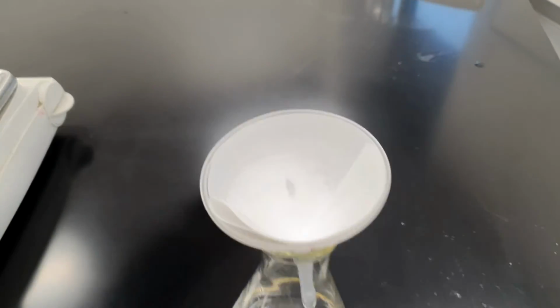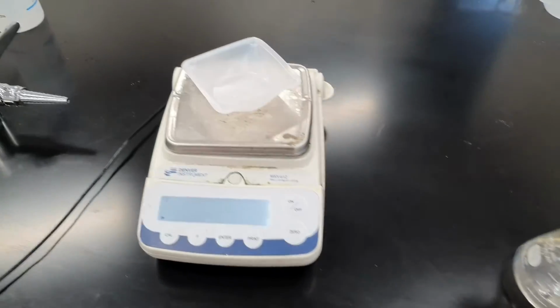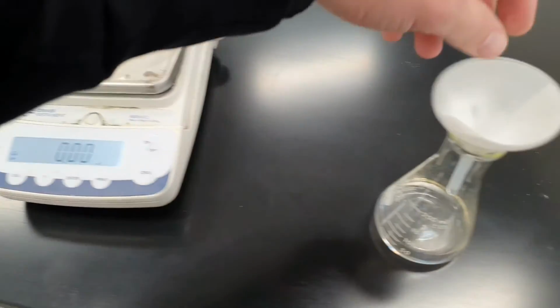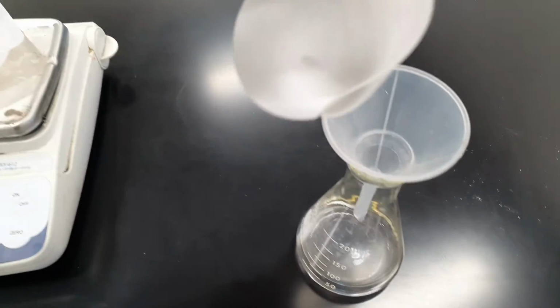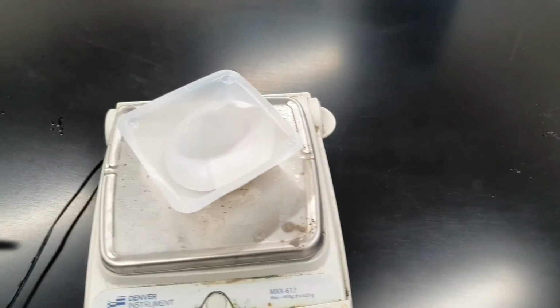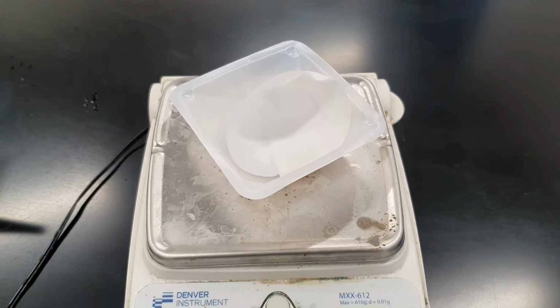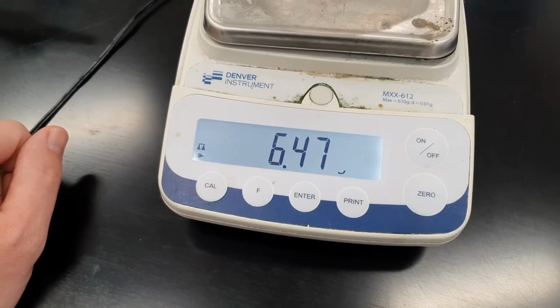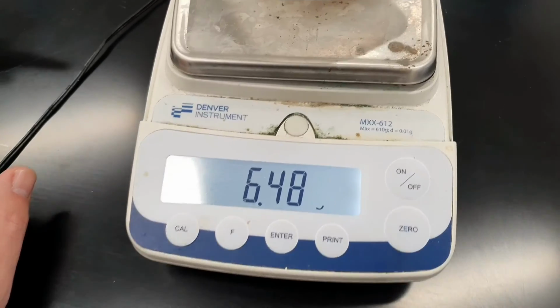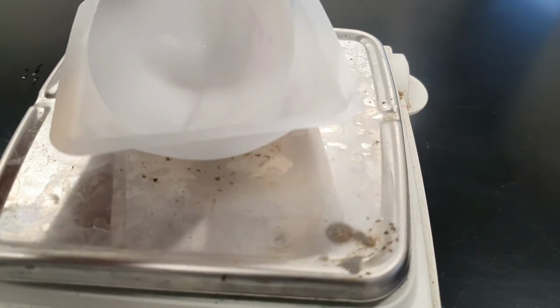So what we're going to do now is weigh this. I'm going to put a weigh boat on and zero my scale. I'm going to take this and let's see how much product we made. If we remember, the filter paper had a weight of 1.04 grams. So if we look here, it's 6.47 grams.